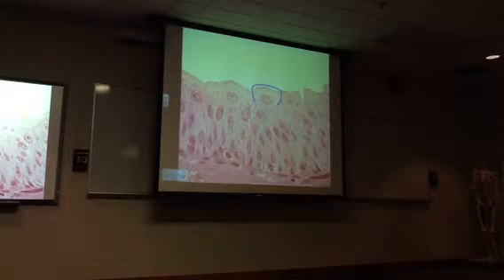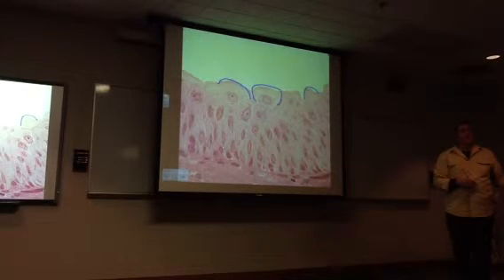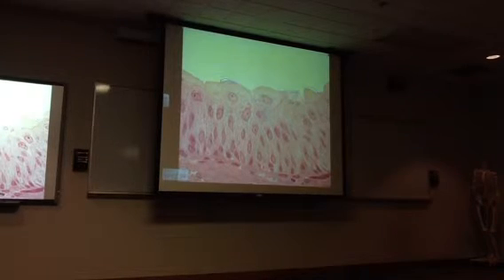Identify the tissue. Those are the big dome cells on transitional epithelium. Okay? Big dome cells on transitional epithelium. Okay? Look at this one. Yeah, I'm in one cell, and there are two nuclei there.